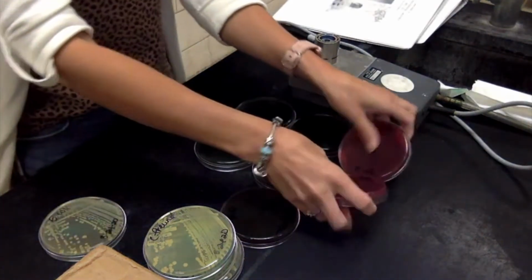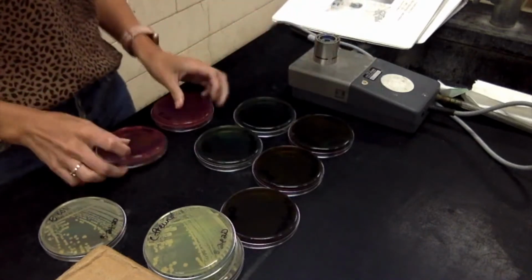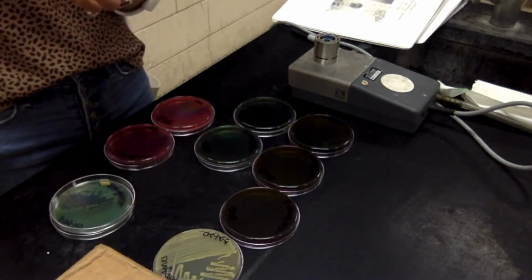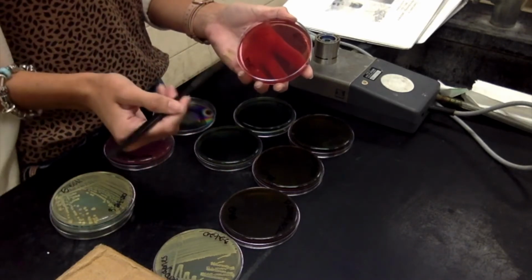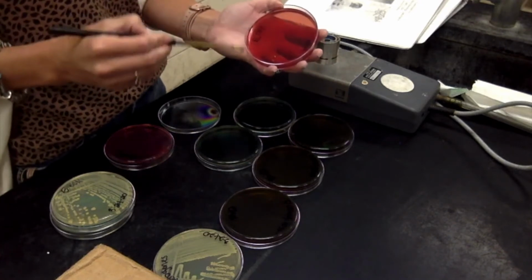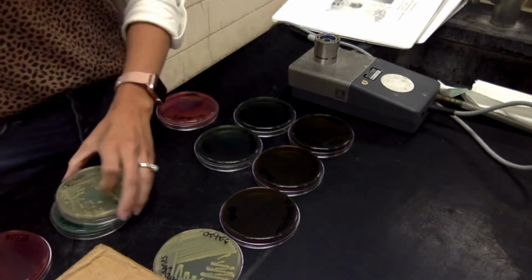Now I'm going to move on to the MacConkey. Here's what the MacConkey looks like before. Okay, it's like a pinkish color, because remember that neutral red turns that hot pink color. And the 2 bacteria I'm using for this are E. coli and Pseudomonas. So I'm going to do my E. coli plate first. Done. Now I'm going to do my Pseudomonas plate.